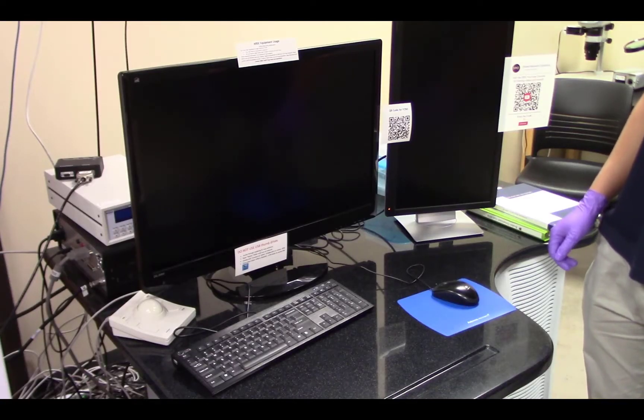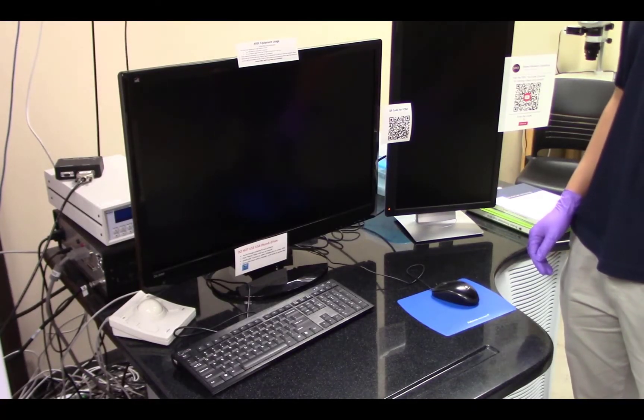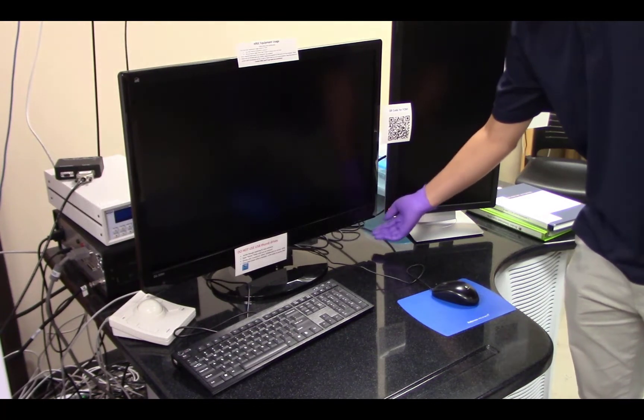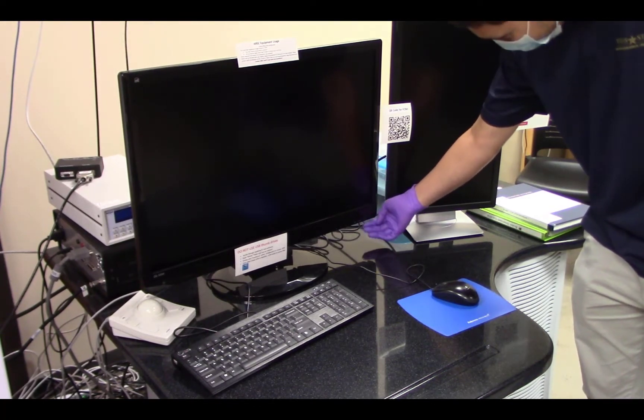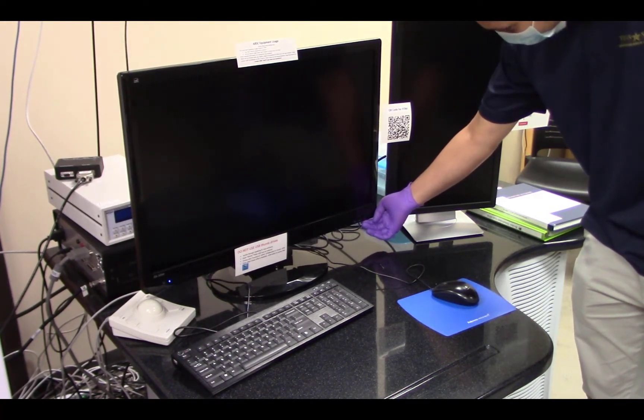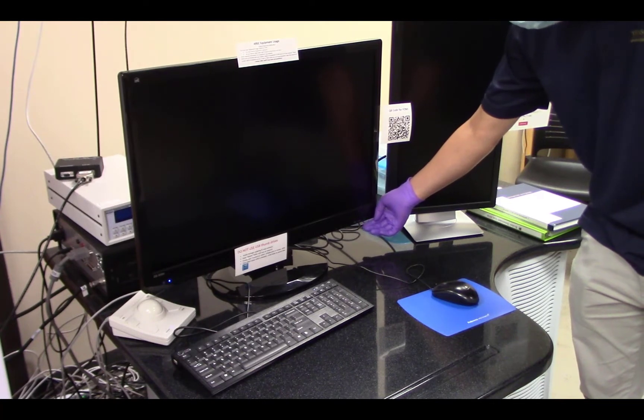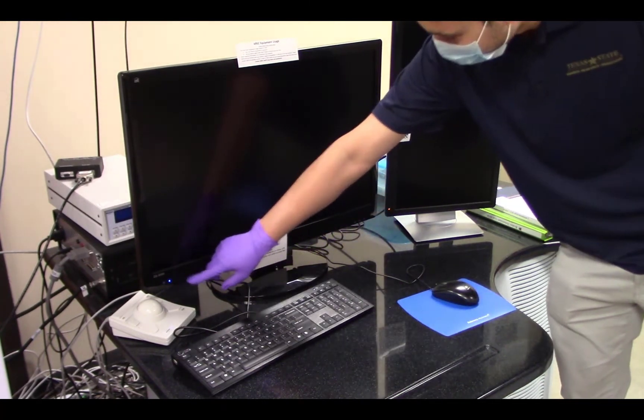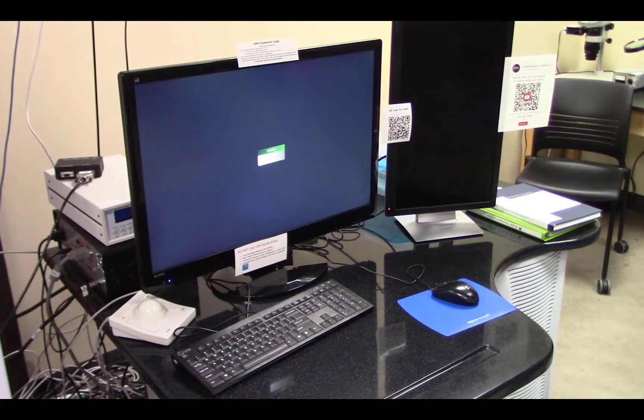First, we'll start up the equipment. Turn on the large monitor by pressing the button on the right-hand side. The LED light will turn blue, indicating that it is on.